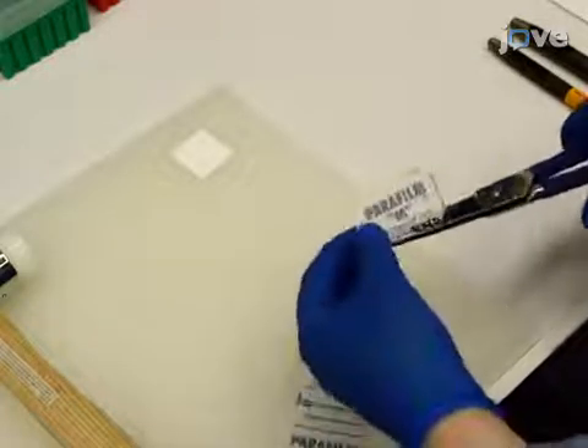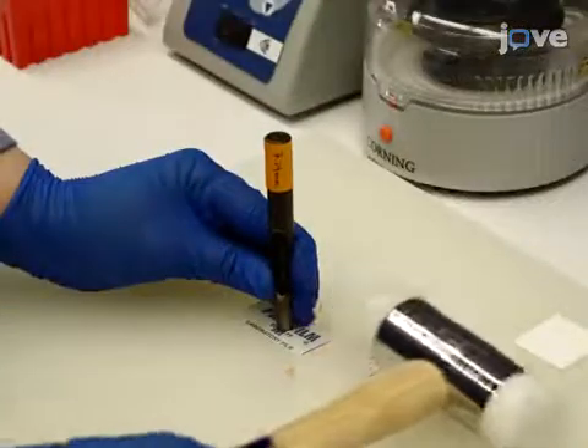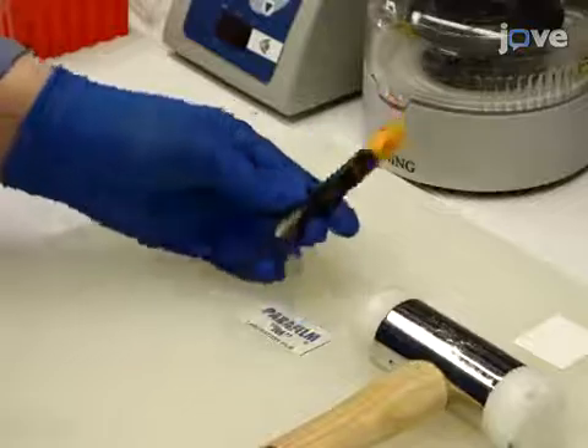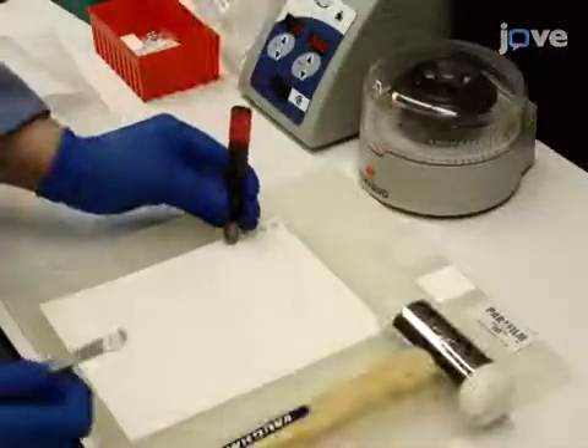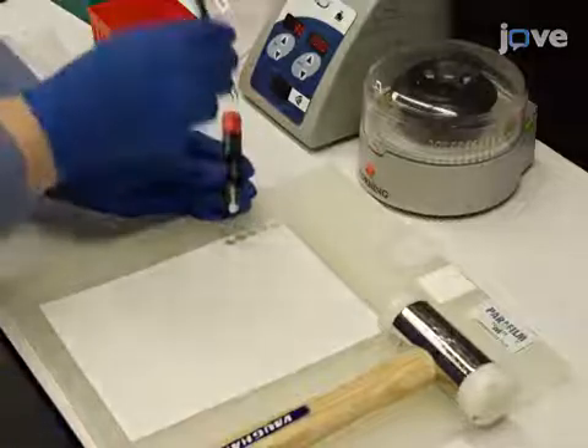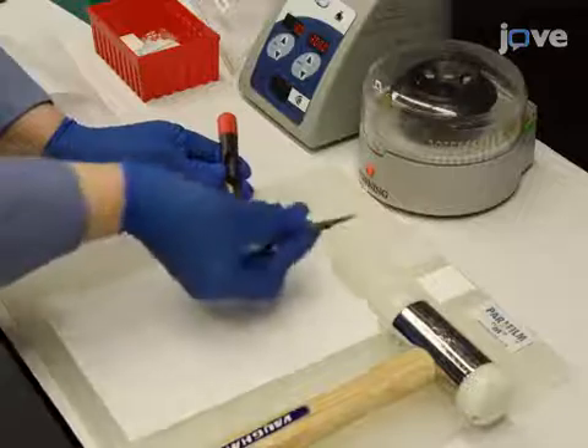Cut a 25 x 50 mm piece of paraffin film, and then use a hammer to punch a 7.14 mm diameter hole in the center of the tape. Prepare a bound glass blood separator membrane, or capture disk, by using a hammer to punch an 8.35 mm diameter circle.